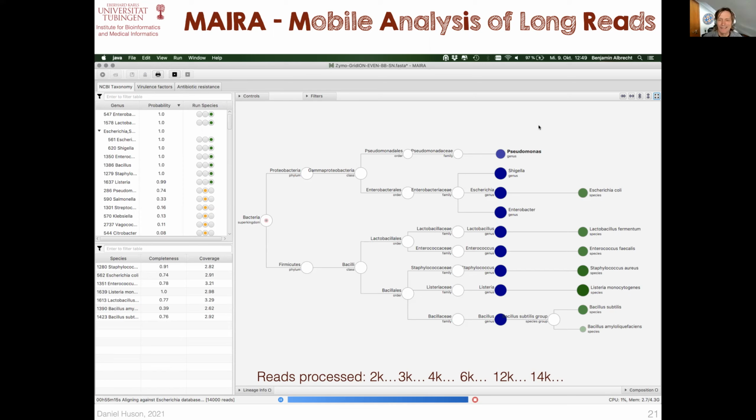So you can see here, the first part of the analysis produces these blue genus-level assignments, and then once we're confident that a certain genus is present, all the reads are also aligned against the species databases. Yeah, so that's the basic idea. And the idea is to do this in a way that can keep up with the base calling.